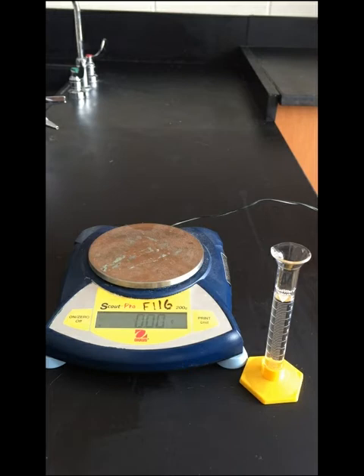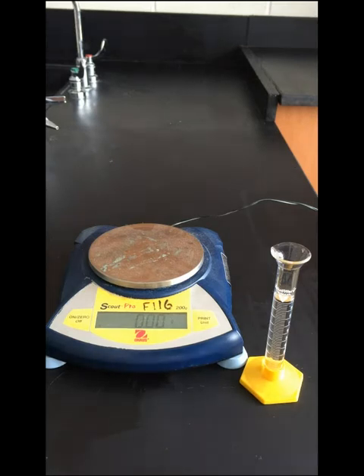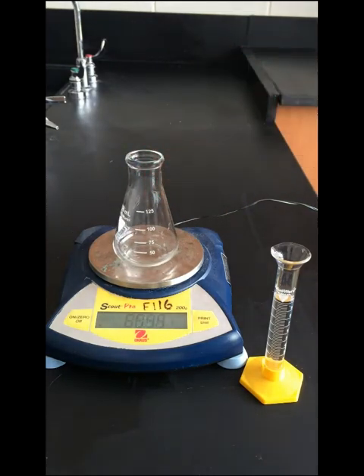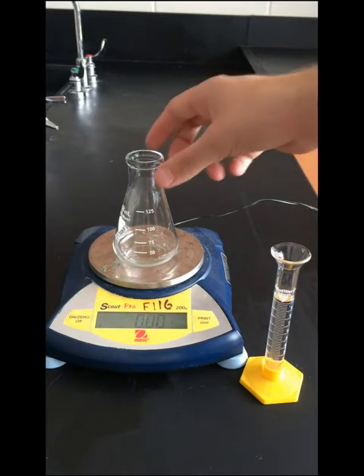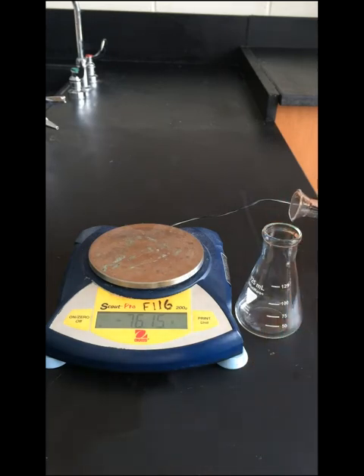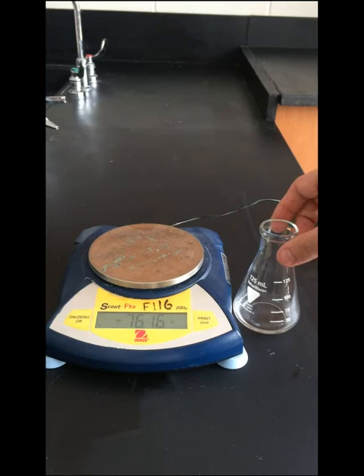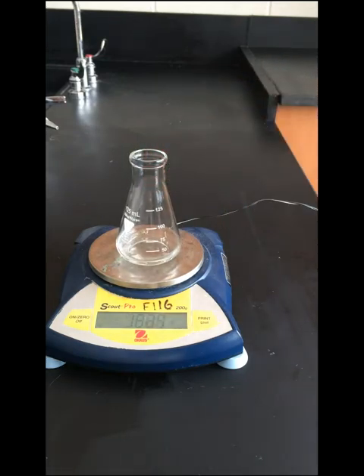We measure out 10 milliliters of the vinegar solution. But because we will be doing a percent by mass calculation, we also want to determine the mass of the vinegar. We tare the flask. Adding the vinegar to the flask off the balance. And then we return the flask to the balance to determine the mass of the vinegar in the flask.